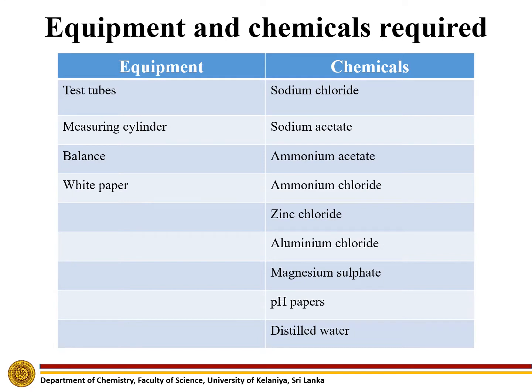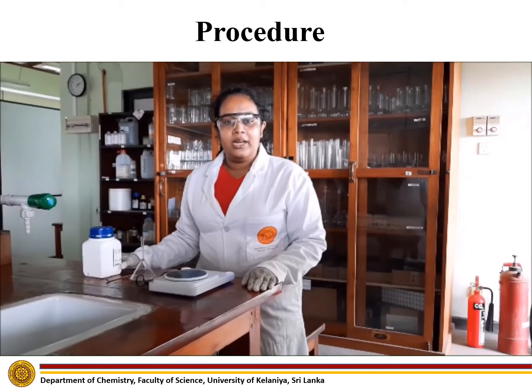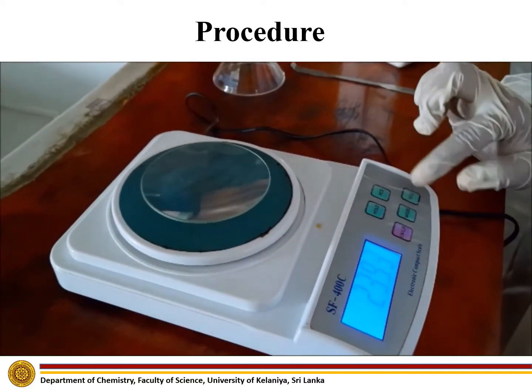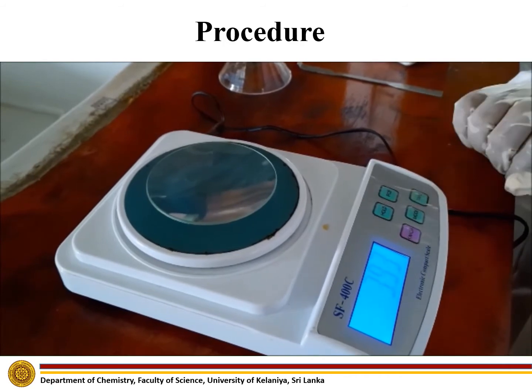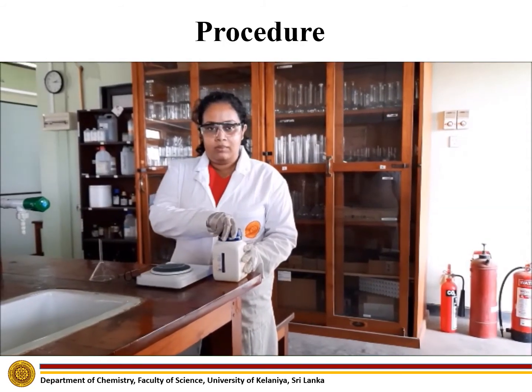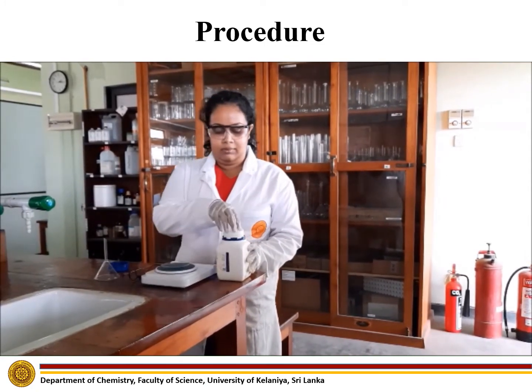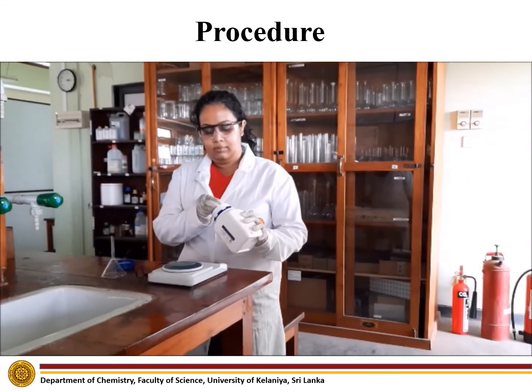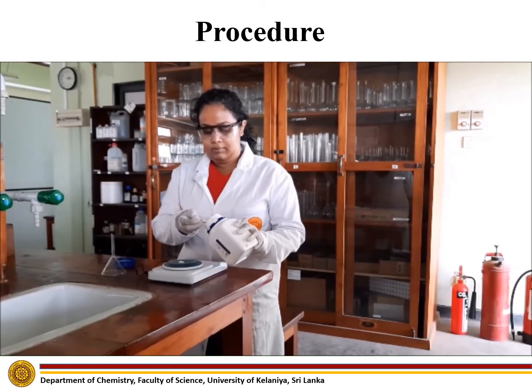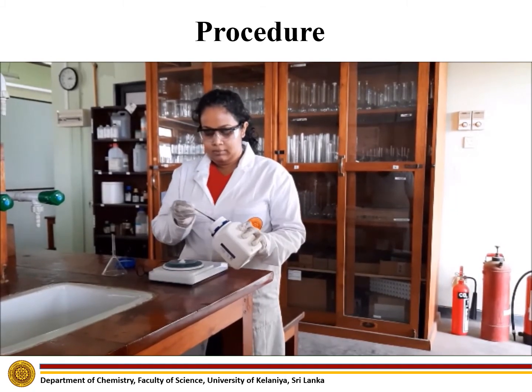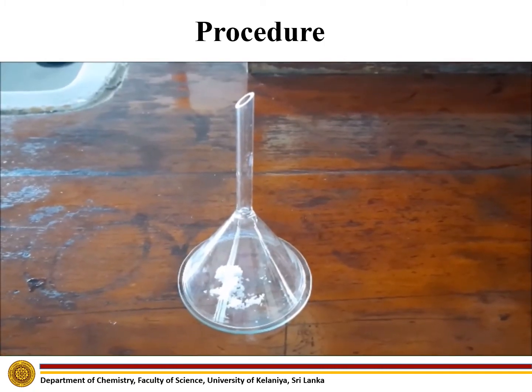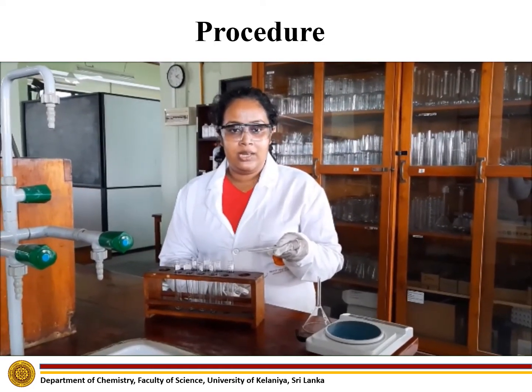Next, let's see how this experiment is performed. First, we measure 0.5 grams of aluminium chloride salt. Put the watch glass on the balance and make its reading 0, then measure 0.5 grams. Next, we put the measured salt into a test tube.